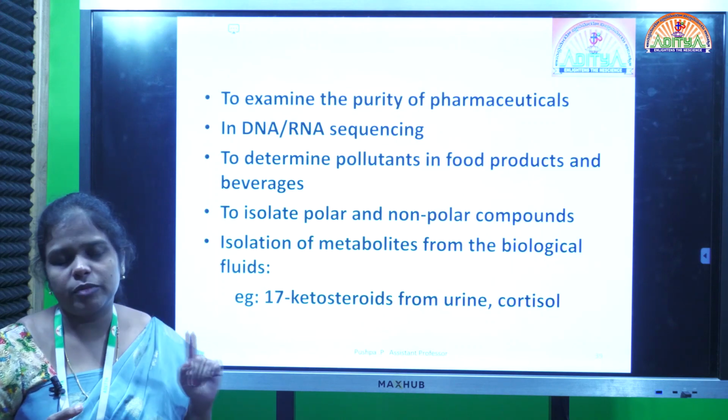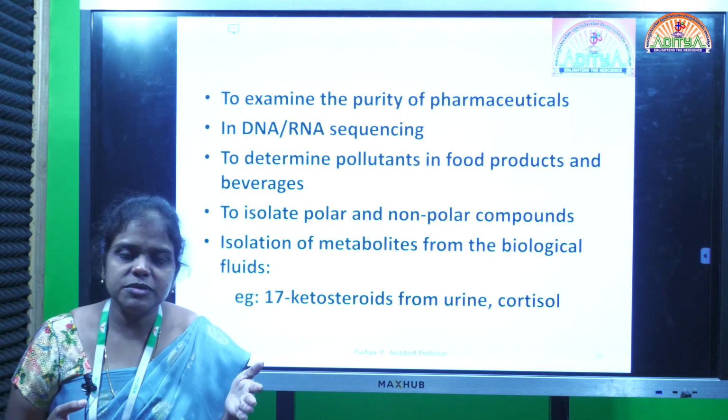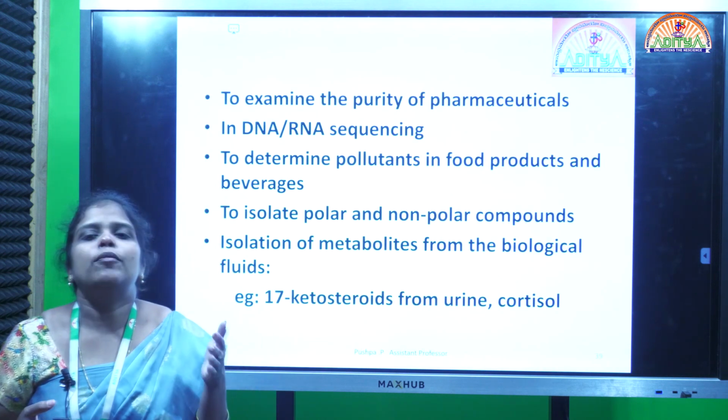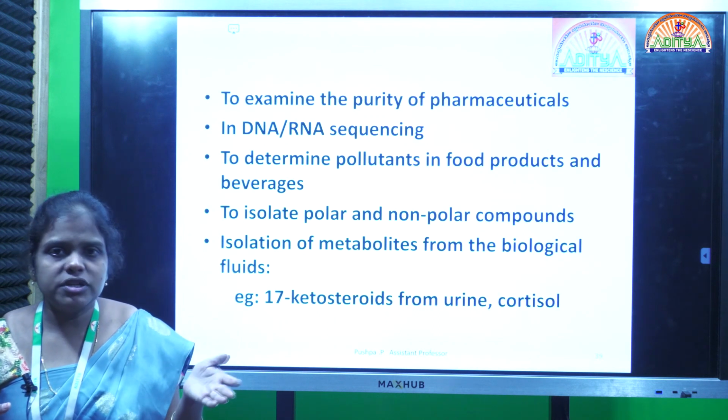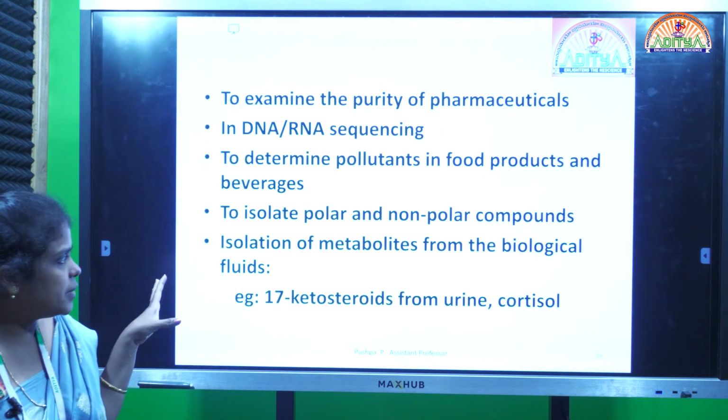And also we can use this column partition chromatography to isolate polar compounds and non-polar compounds. That means polar compounds means which are having more polar nature, OH group containing compounds, and also to separate non-polar compounds also we can use this column partition chromatography.